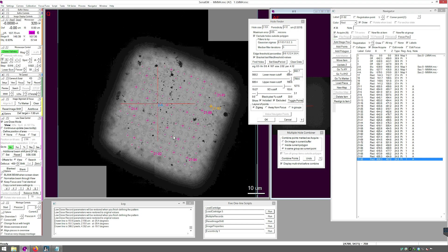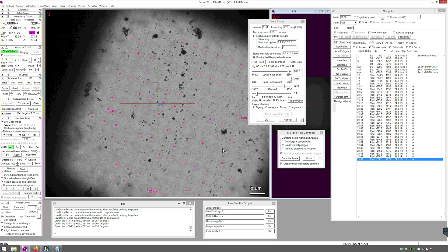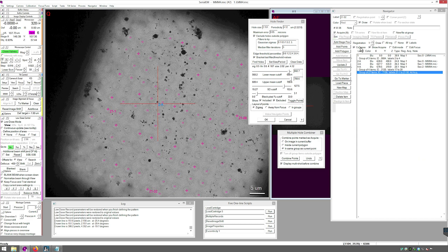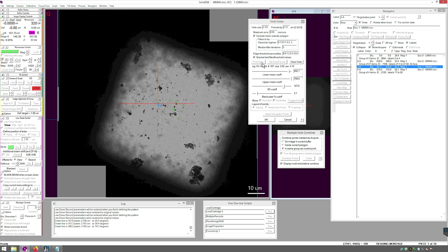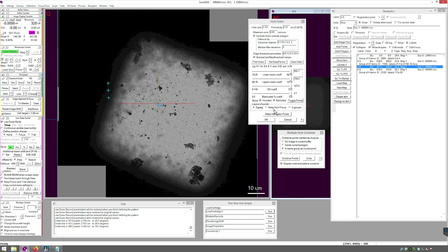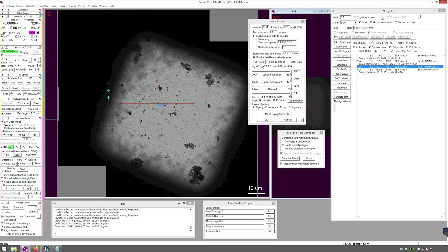If you click Show Acquire in Navigator, you can see where everything will be. To process the next Medium Mag Montage, move your group of points under the map it corresponds to. Double-click the next map and then press Find Holes. If you have an area with issues, first try changing the maximum error to 0.1.